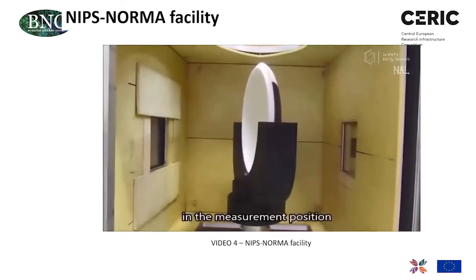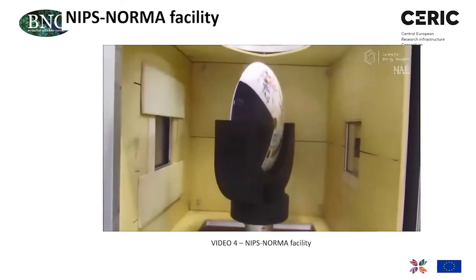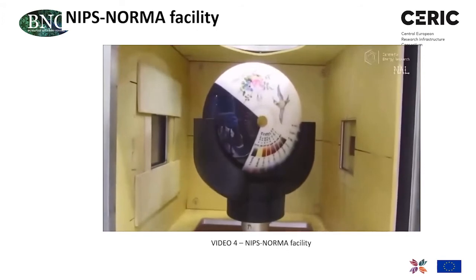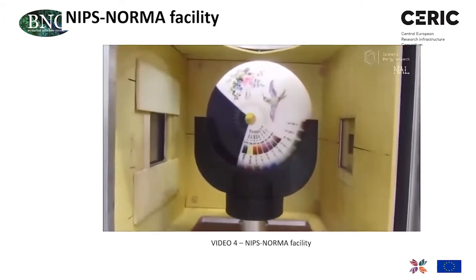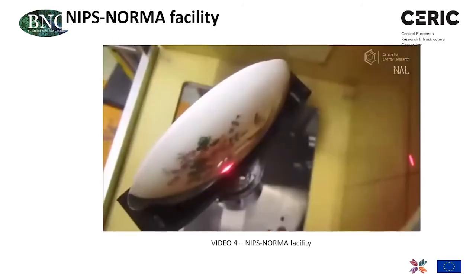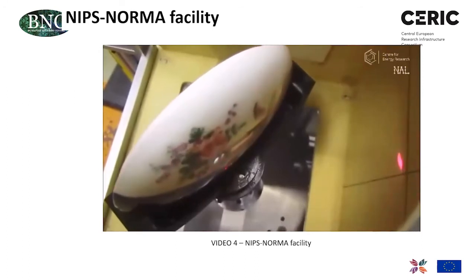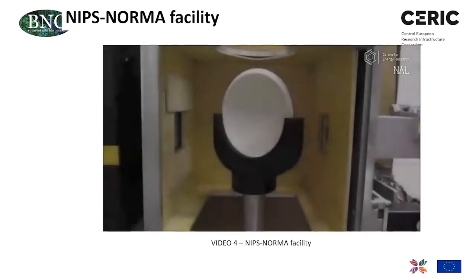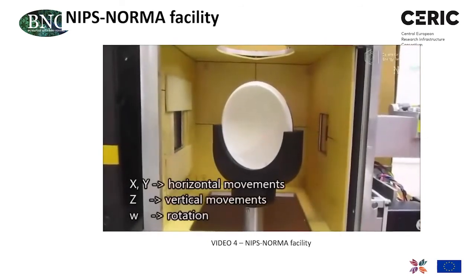This way we can safely measure the sample without the risk of breaking it. And of course, within the one object, we can also move and select measurement positions.